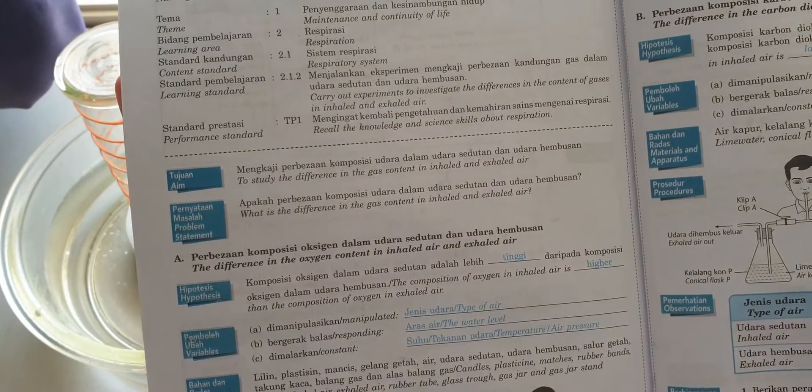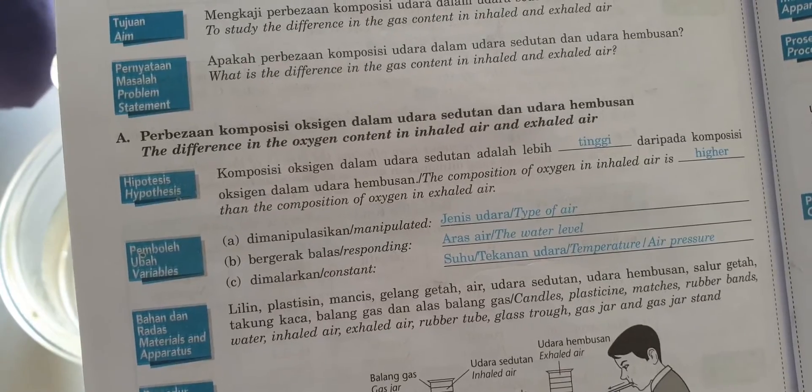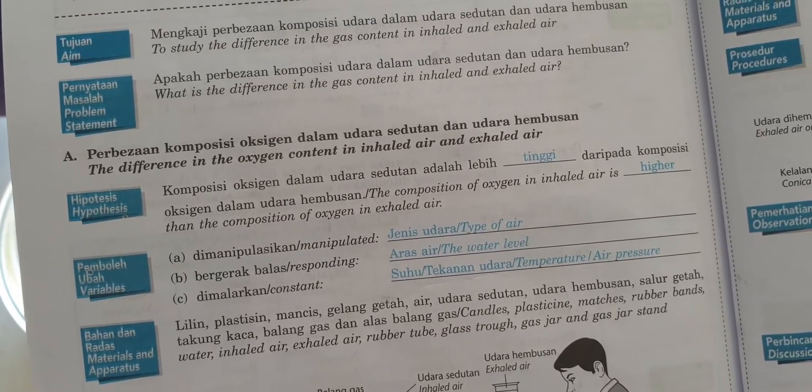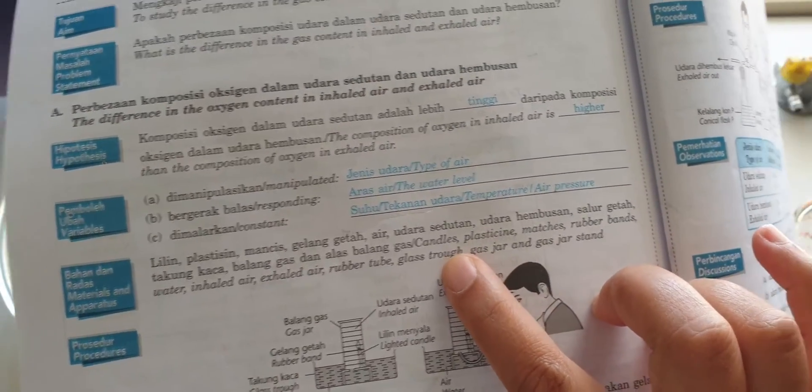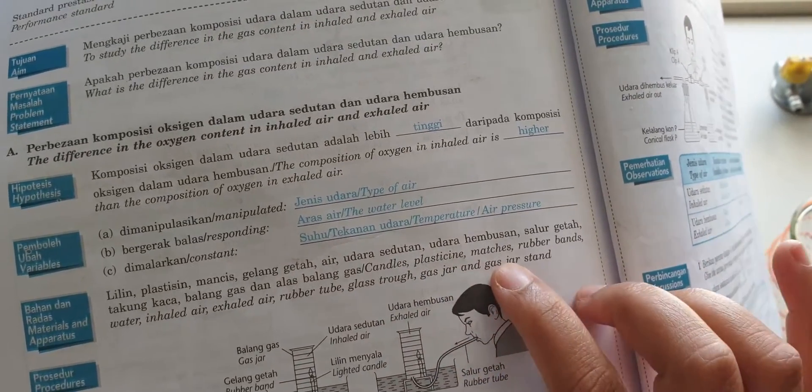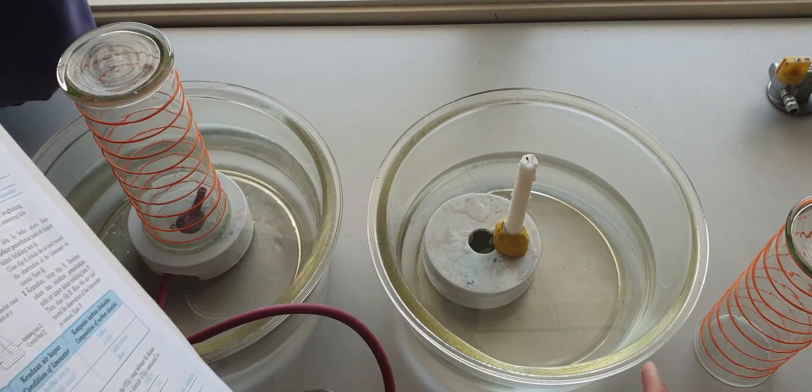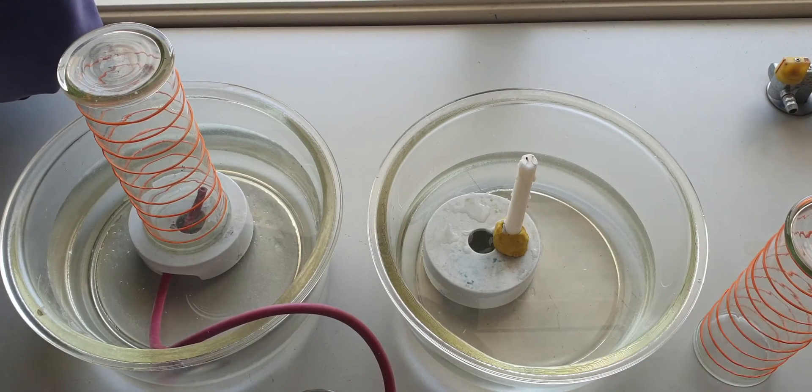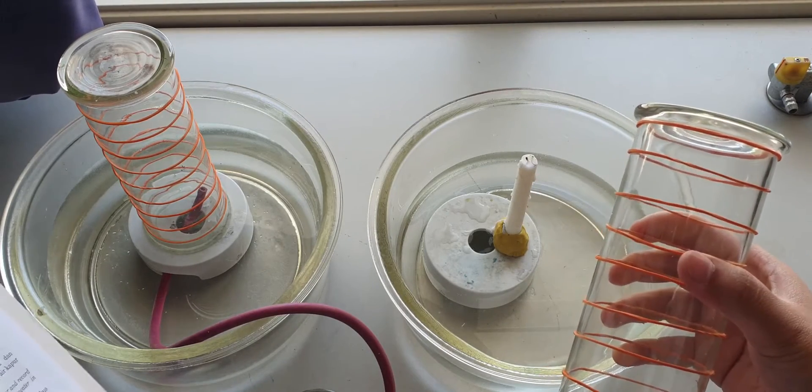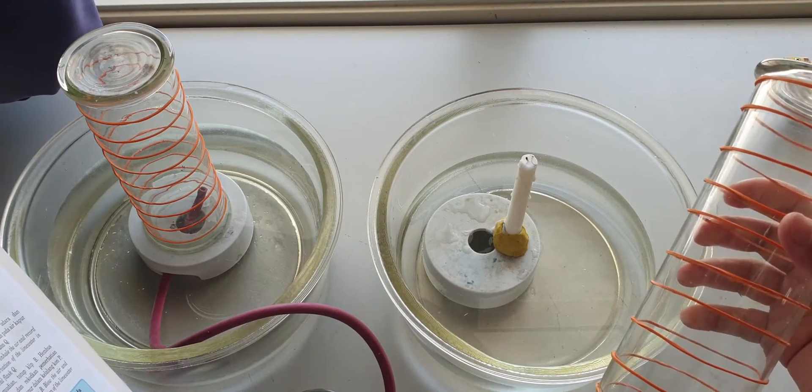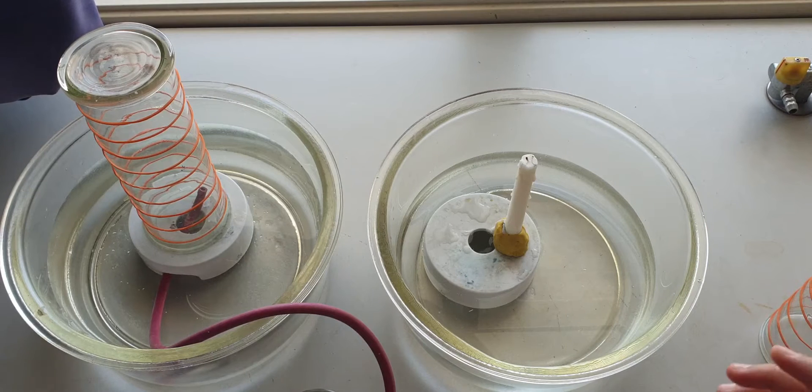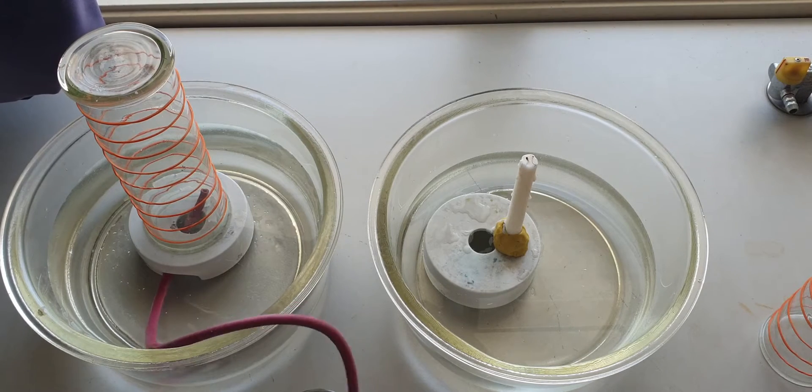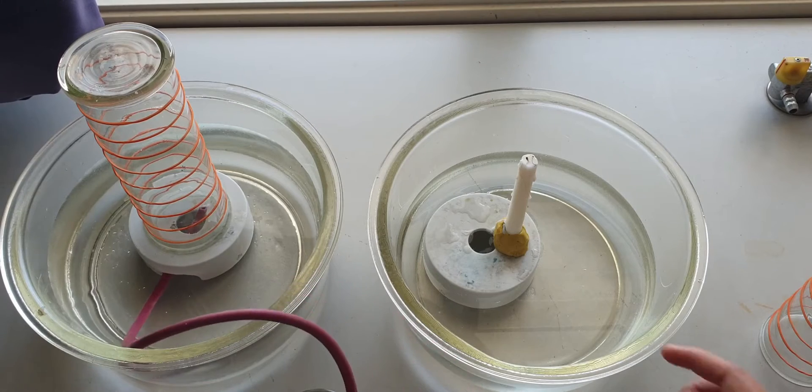The first experiment is to study the difference in the oxygen content in inhaled air and exhaled air. What you need in this experiment are candles, plasticine, matches. You have the candle here, the plasticine, some matches, rubber bands that I already put on the gas jar, and you need glass straws. Actually you need only one but I use two glass straws and some rubber tubes and the candle stand over there.